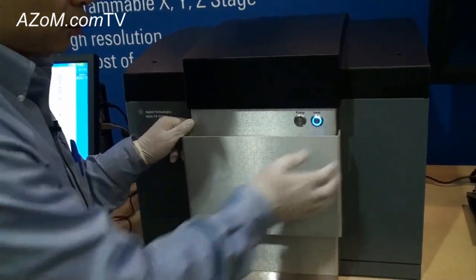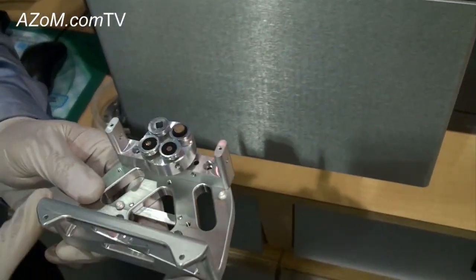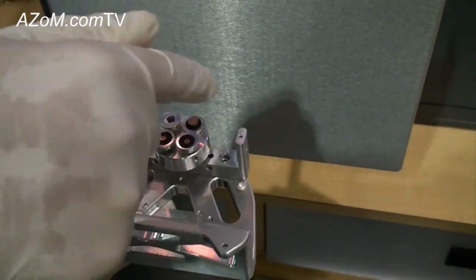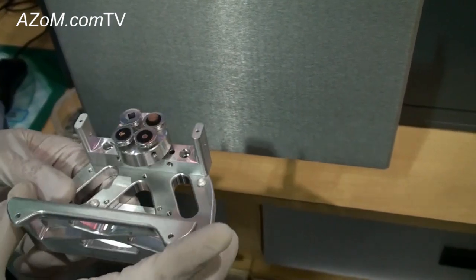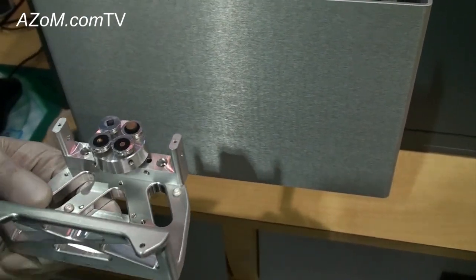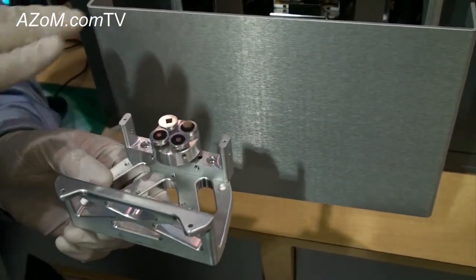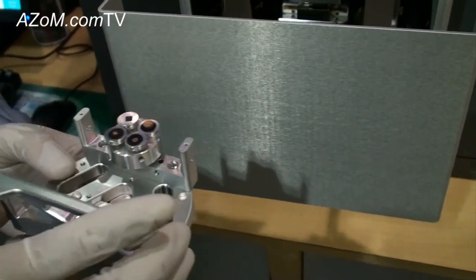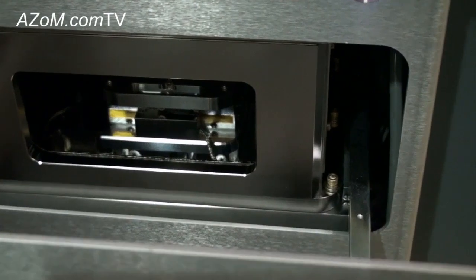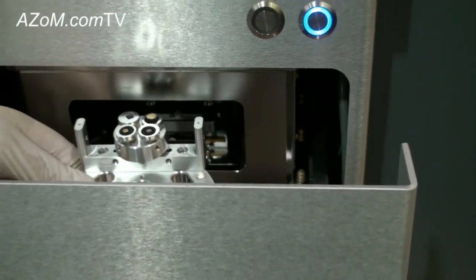Here is the sample chamber — open the door. This is the sample holder, so this is the area where you can load your sample. You can load multiple samples in one batch or just load one big sample. In our software we have predefined locations so you can easily move to positions you've already programmed, and of course you can set up your own positions as well. You can see the stage there — it can move in the X, Y, and Z directions.